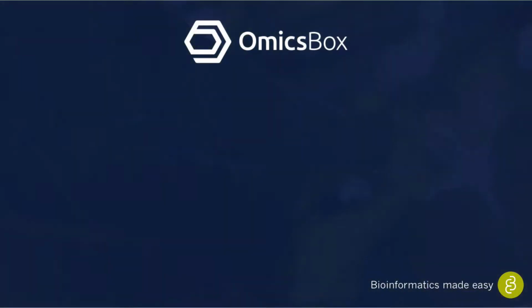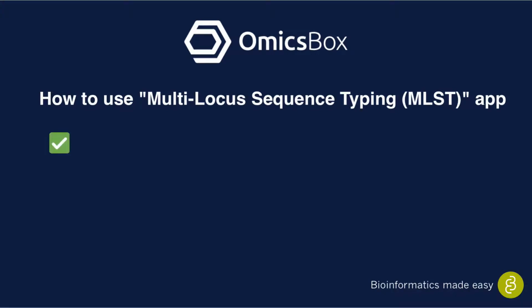Welcome. This video will show you how to use the Multi-Locus Sequence Typing MLST app.